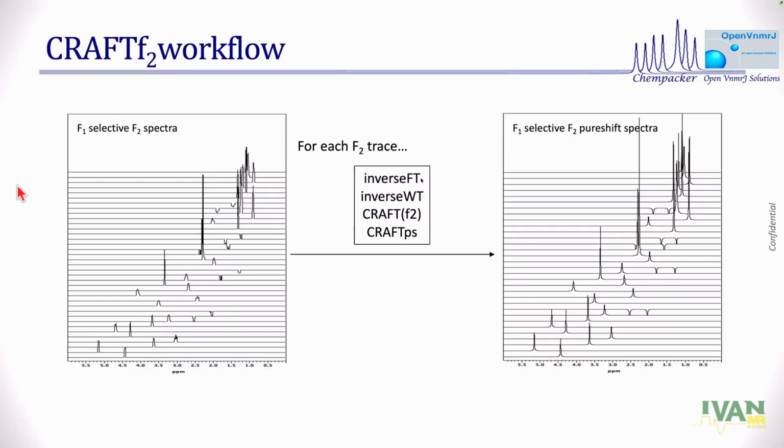The interferograms are based upon starting from a truncated FID, and in order to deal with my sinc artifact, I have to apodize, and I have to construct an interferogram. That's where I am starting off.